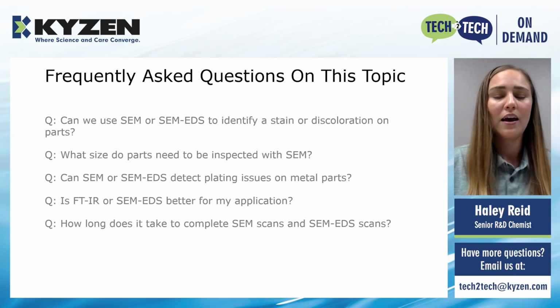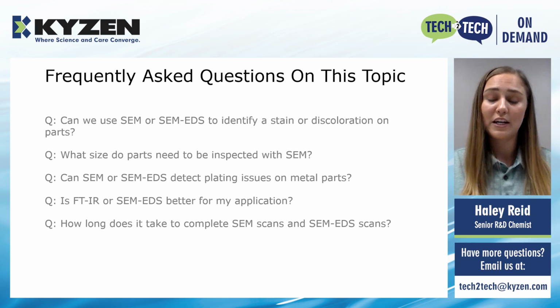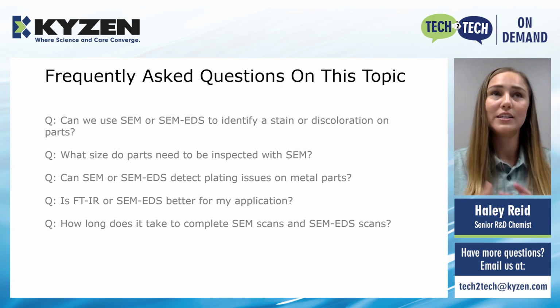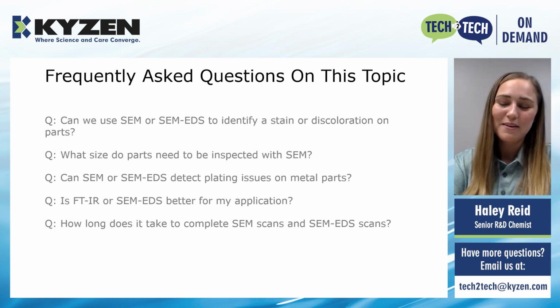of your part. SEM EDS, if we wanted to get a very pretty picture and a map like we've seen in this presentation, that's usually going to take an hour or more because you want multiple scans of that to get a good picture. Where if you're just doing a quick scan to say, hey, what elements are here, what elements are not, it's a 1 minute scan and it's a very quick scan. That's all for my presentation.